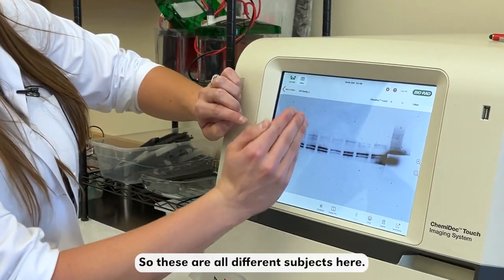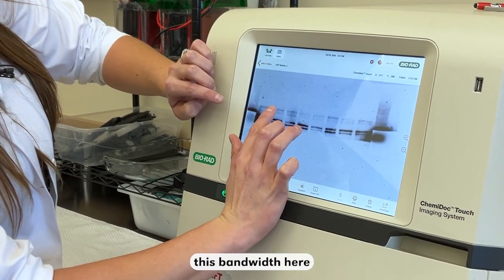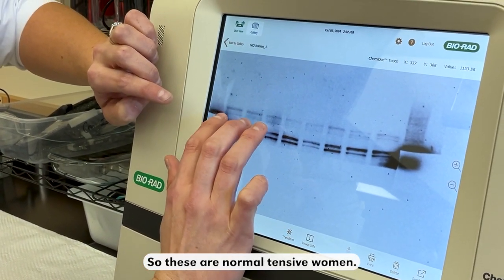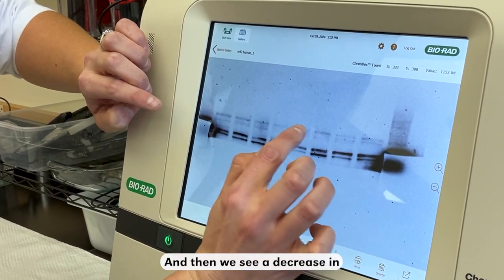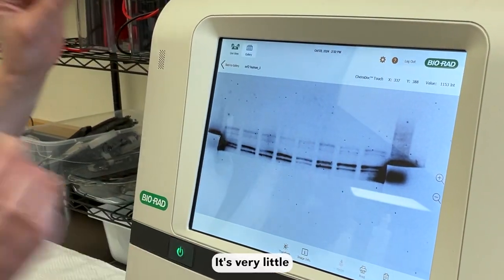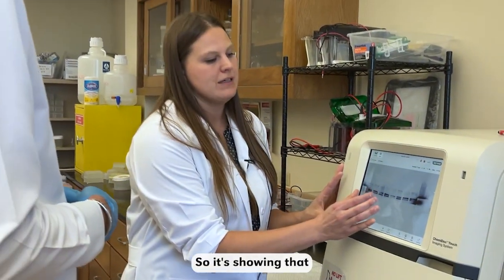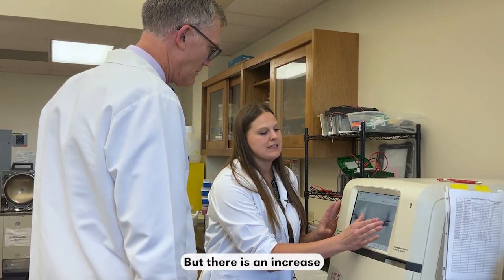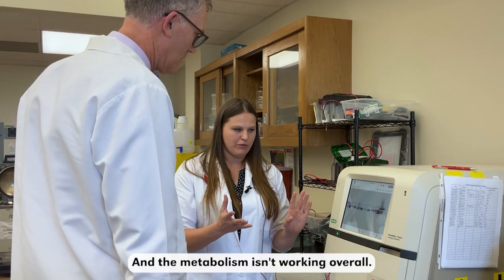So these are all different subjects here. And we're actually looking at this protein band, this band up here. Okay, so these are normotensive women, okay, normal. And then we see a decrease in these proteins up here in our hypertensive samples. It's very little, but it is there. So it's showing that there is, kind of opposite of what you think, an increase in oxidative stress in these women and the metabolism isn't working overall.